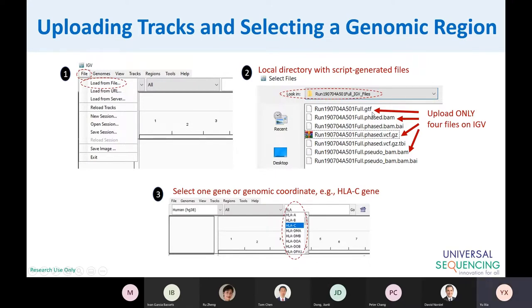For example, in our case, I select to show the detail on click. That means if I click this item, for example, this one, then I will get the information. There's a pop-up window shown here.